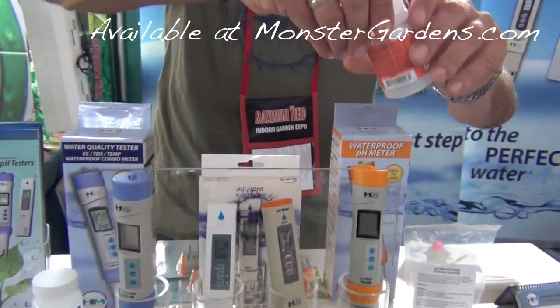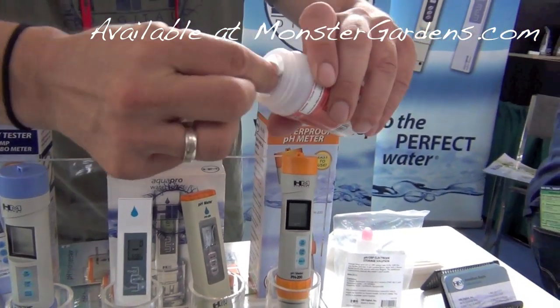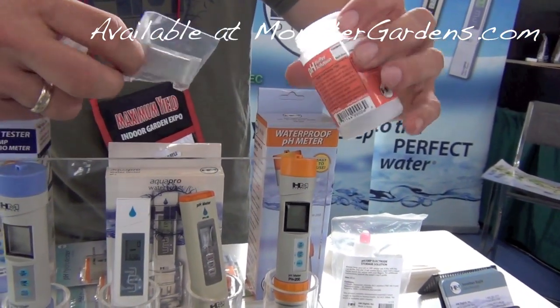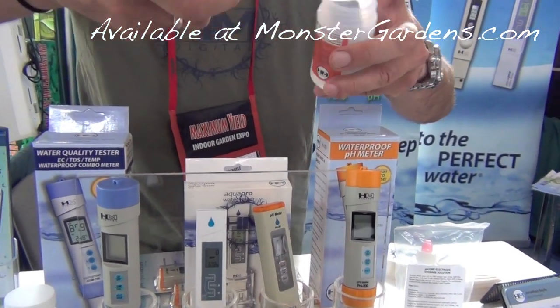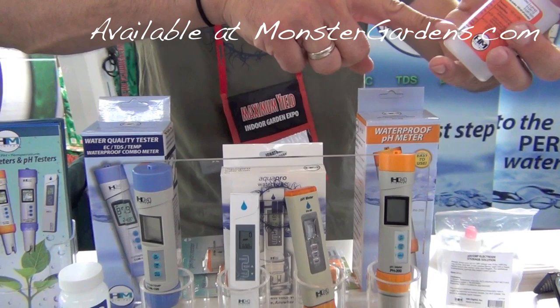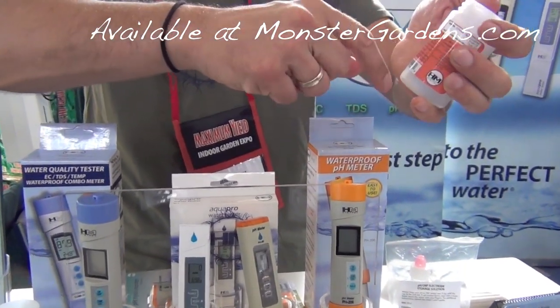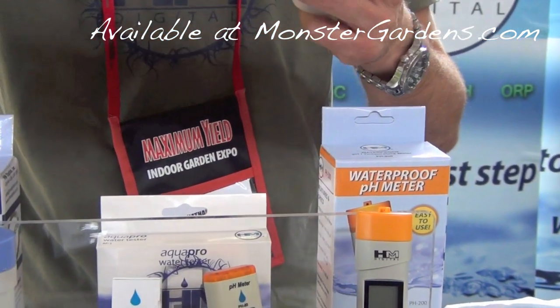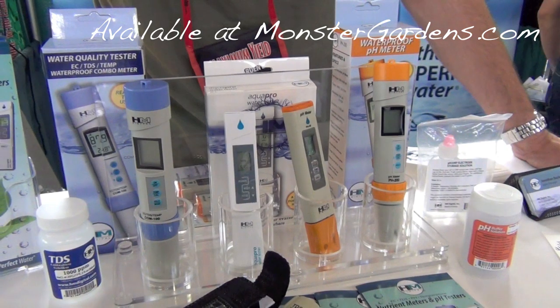And then our pH buffers — we do 12 individual little packets: 3 pH 4s and 6 pH 7s. It basically has an indefinite shelf life. A little packet will make solution — you just put regular tap water with one of those little packets and you know, you have solution for two weeks to a month. You can use any brand of calibration solution, not just HM.